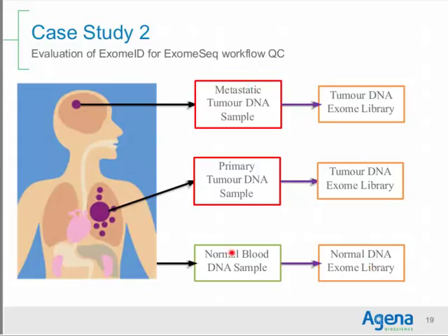The challenge that we were presented with was to make sure that all of these biological samples matched, and also that all of the exome libraries that were generated matched, because this is a reasonably complex workflow that has the potential for sample mix-ups.